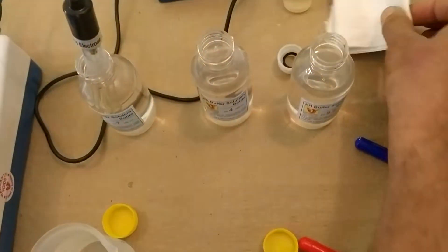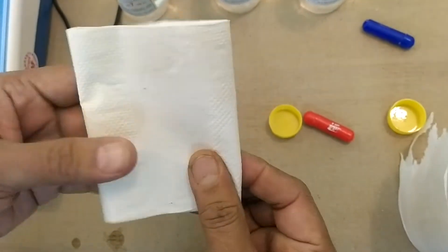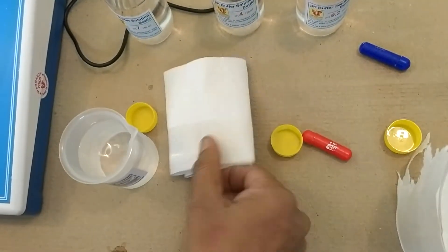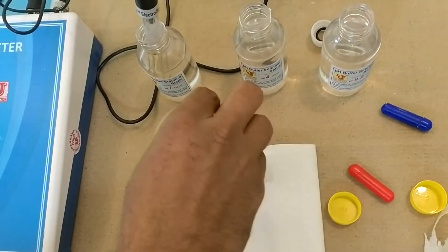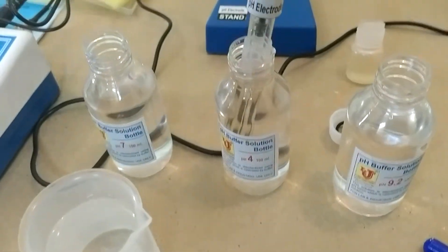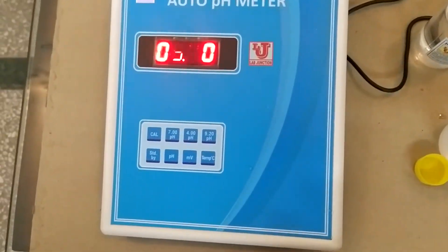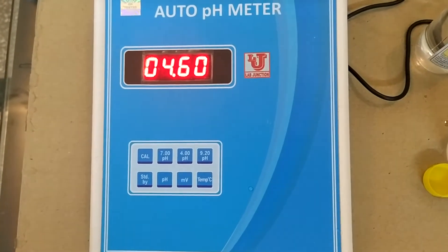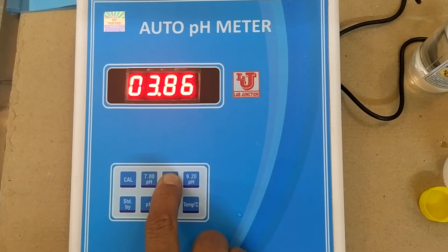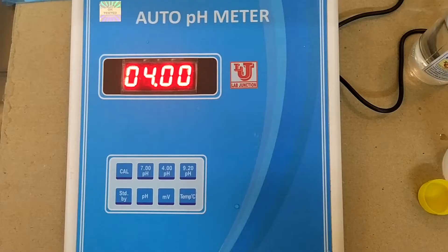Now rinse and dip in 4 pH solution. The reading goes down to 4 pH. Suppose 3.87 comes — then press 4 and 4 comes. This is the 2-point calibration.